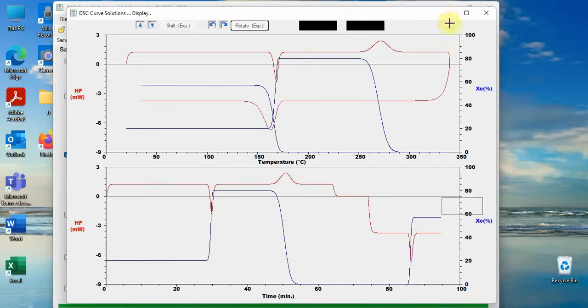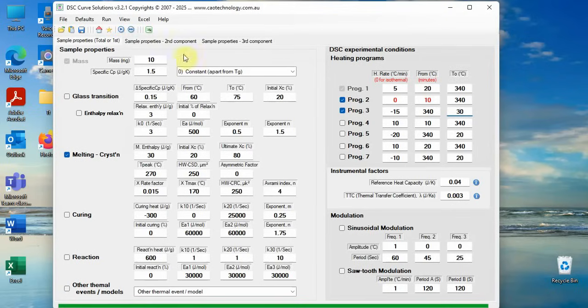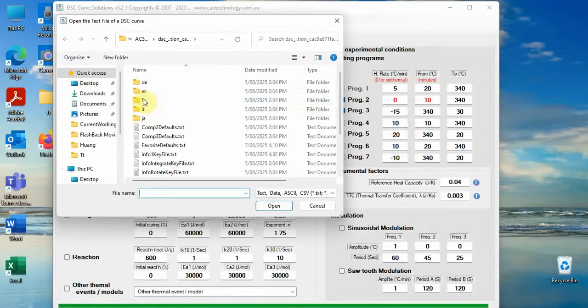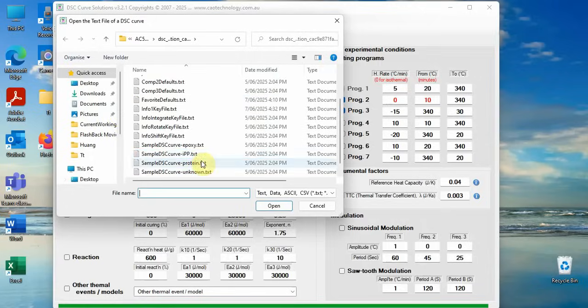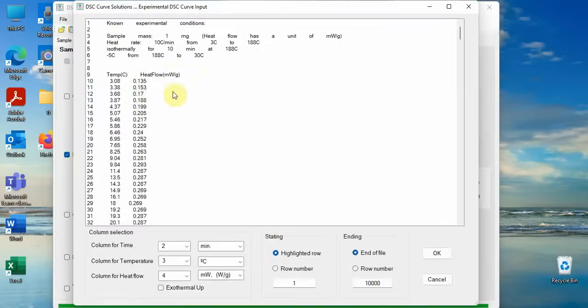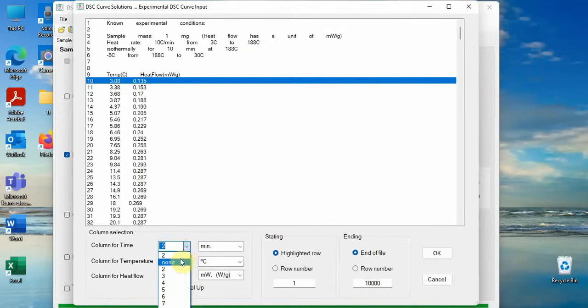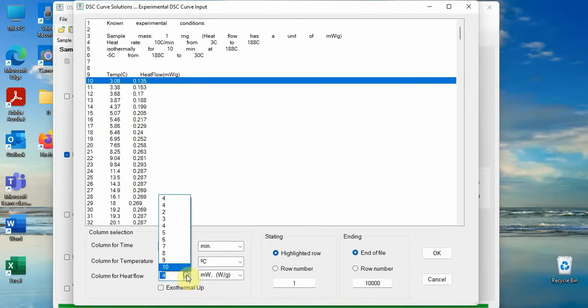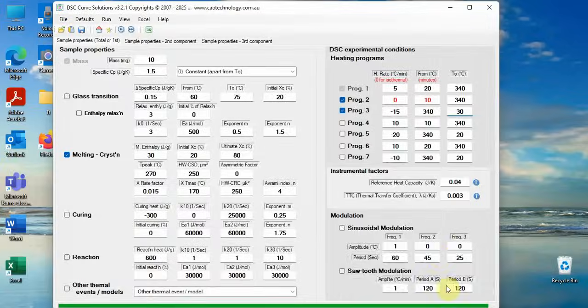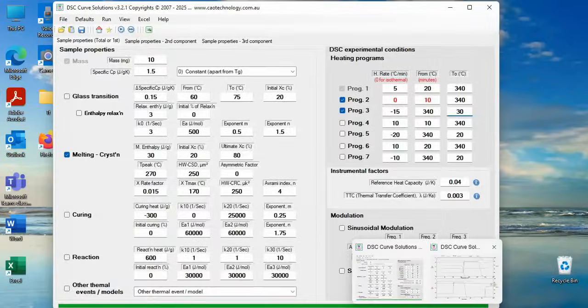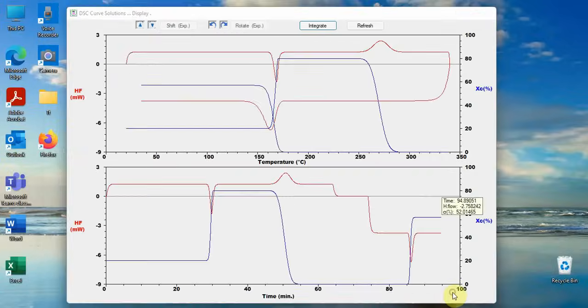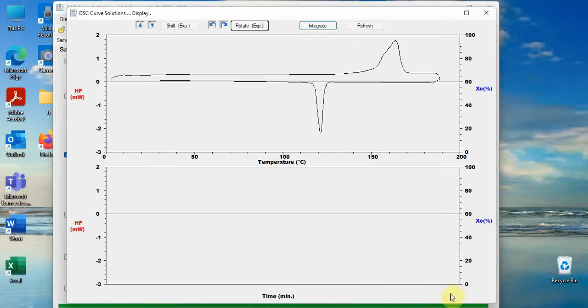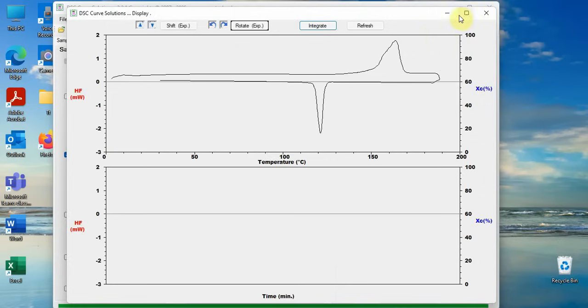Now, let's see how DSC curve solutions fits for real DSC experimental curve. We open a data file. Sample mass and DSC conditions are here. This file does not have time. Column 2 is for temperature and column 3 for heat flow.